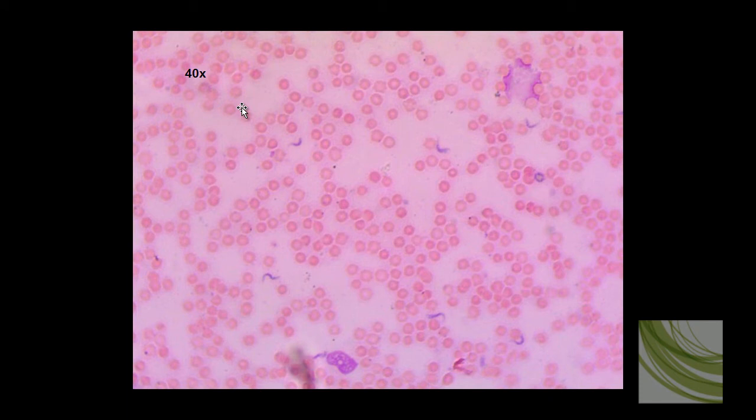It's not until we get to the 40X objective that we can see the parasites. Now this is a flagellate, meaning it has a flagella, and we can see it there, and it's outside the blood cells, so it lives between the erythrocytes, and we can also see the occasional leukocyte.